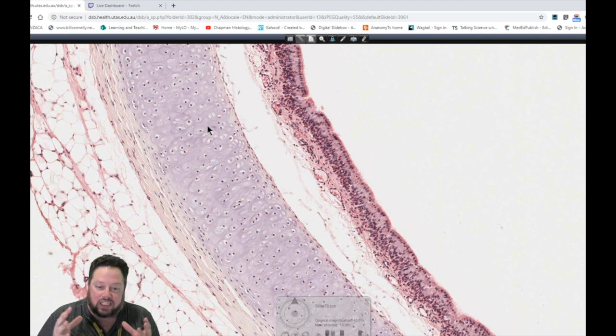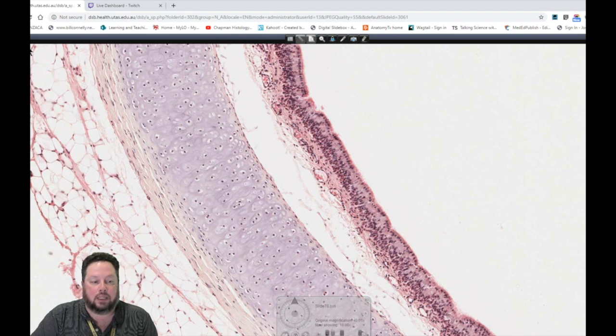I don't ever see anything that looks like it's actively endocytosing or digesting hyaline cartilage matrix, but I haven't spent a lot of time looking for it, but they're not as obvious as you might think, like osteoclasts. So those are very big, very prominent cells. It's a really good point though, and something worth investigating.